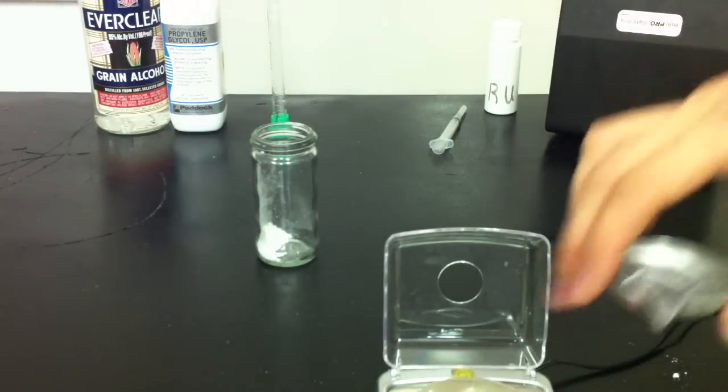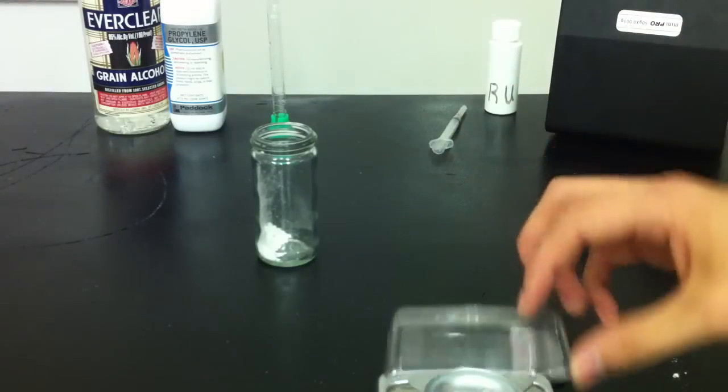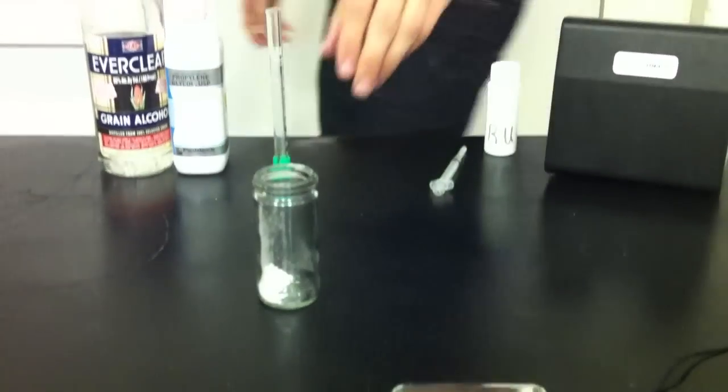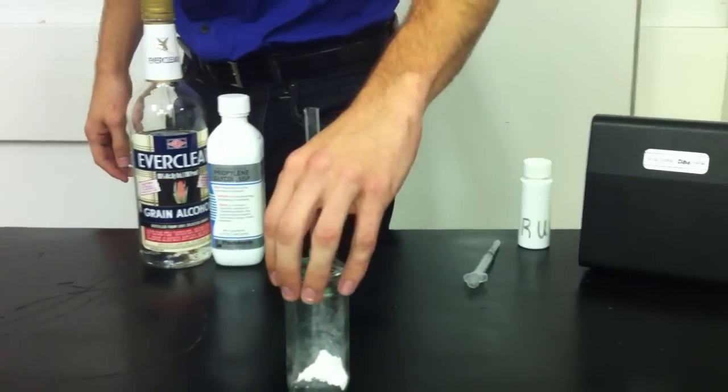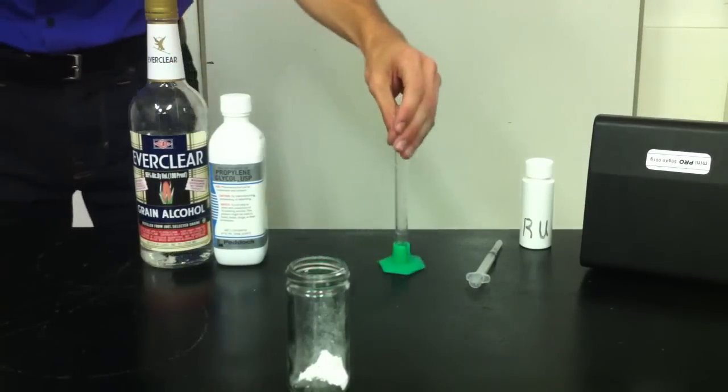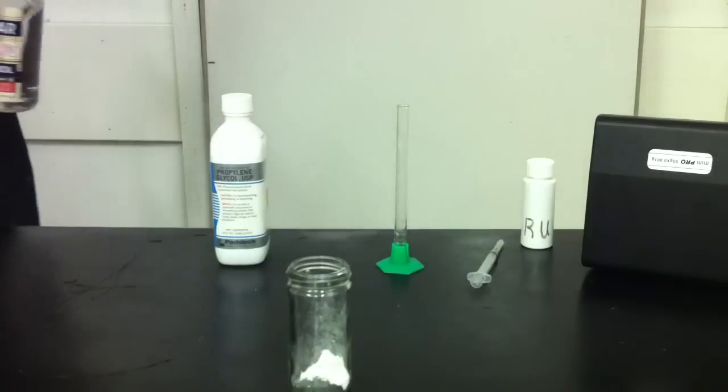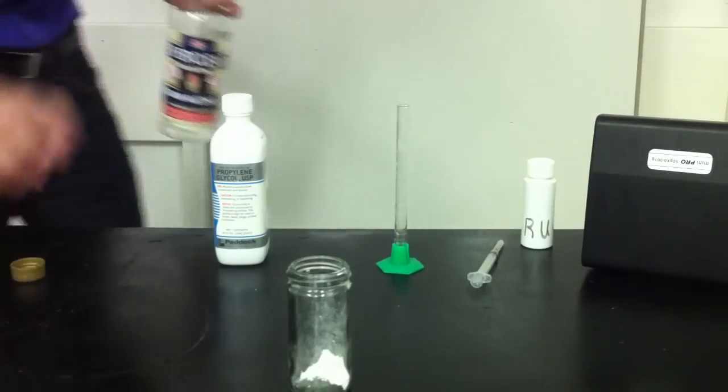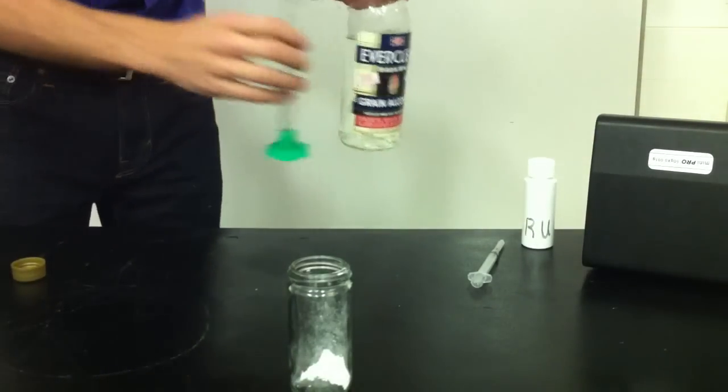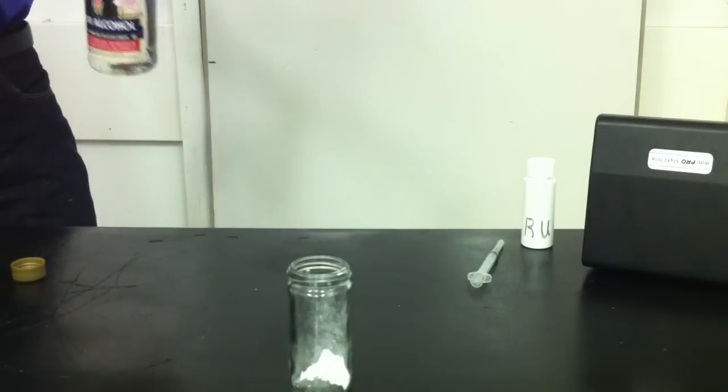Now comes the dissolving portion. So we've got the RU ready to be dissolved, now we need to go ahead and portion out our alcohol. So we know we want 21 milliliters. I've got my graduated cylinder here, just simply measure it out. I'm going to do it in 10 milliliter increments.